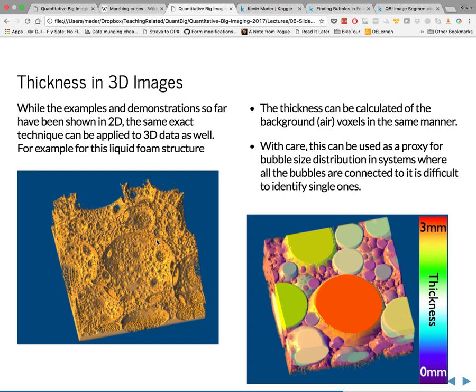Whereas if you had all of these pixels, you could never do a connected component labeling on all of them because there are simply way too many. There are tons of holes, tons of little problems, tons of small artifacts that you would have a really difficult time getting rid of. But when you do a thickness map, you can immediately see where these larger objects are and how they're positioned relative to each other. These are the things that can make your life as a scientist, trying to visualize and quantify things, massively easier.